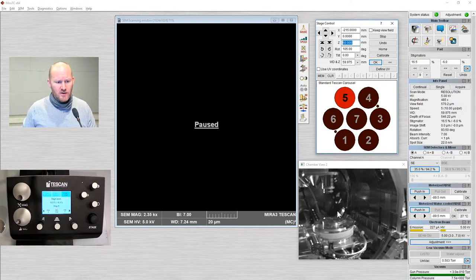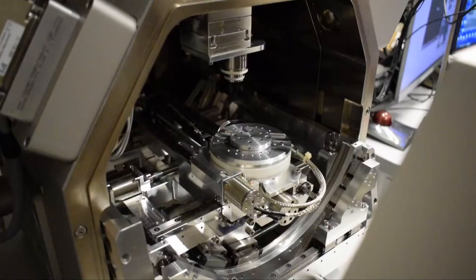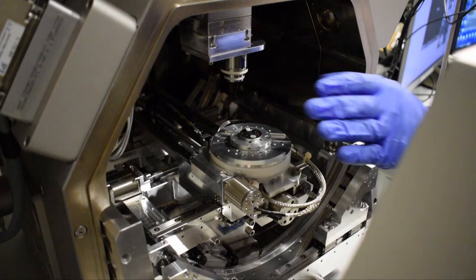You can see a view here of the internal chamber camera — it's a live view of the chamber. I'm going to load the sample right here in the center. If you're operating the Rise or the Mira, 95% of the operation will be the exact same. One thing that separates the Rise from the Mira — Rise means Raman in SEM — I have this objective lens from the Raman system. It's very important that you not touch that or hit it with your sample; we want to give that lots of space.